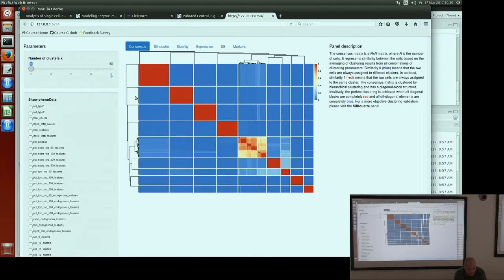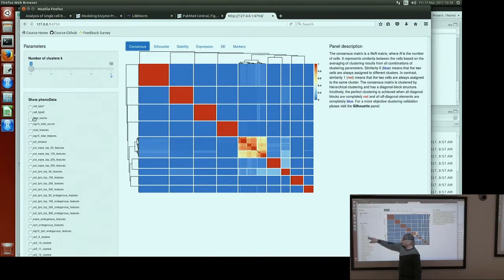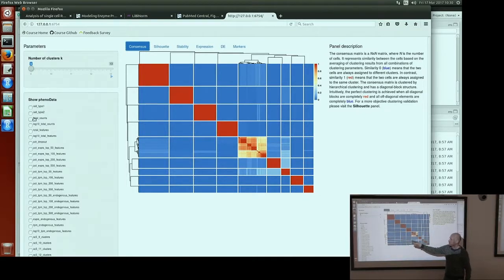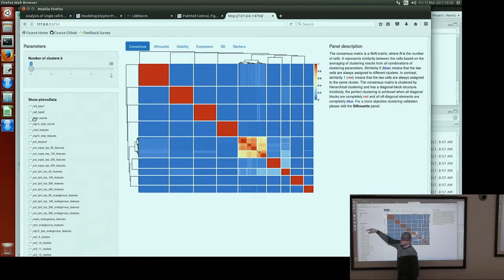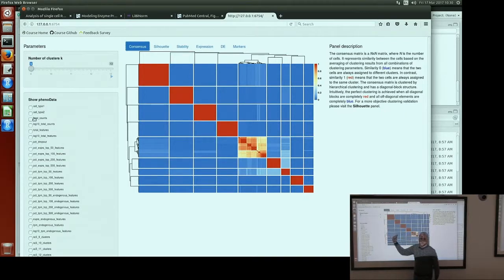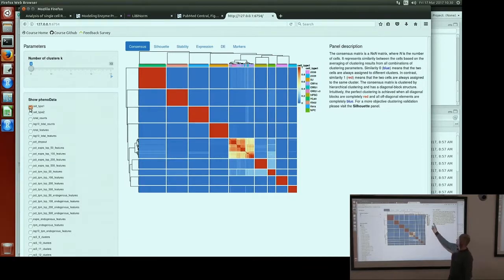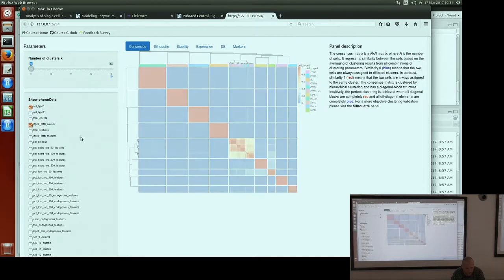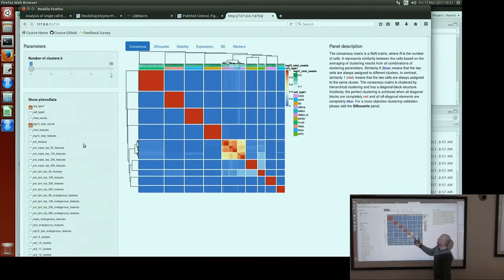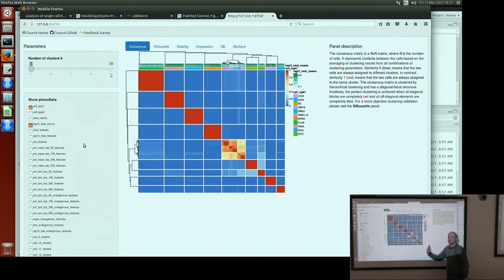If you go back to the consensus tab, on the left-hand side you also have phenodata information. These checkboxes are taken from the phenodata table of your SCATER object — the same parameters you can use on PCA plots, t-SNE plots, when you say color by, shape by, or size by. You can also use them in SC3. If you want to visualize the reference cell types, you click here and it will show you the reference cell types from the Pollen publication. If you want to look at total counts of your cells, you can find that a cluster with much higher total counts may indicate a technical issue — that's why those cells were separated into different clusters.